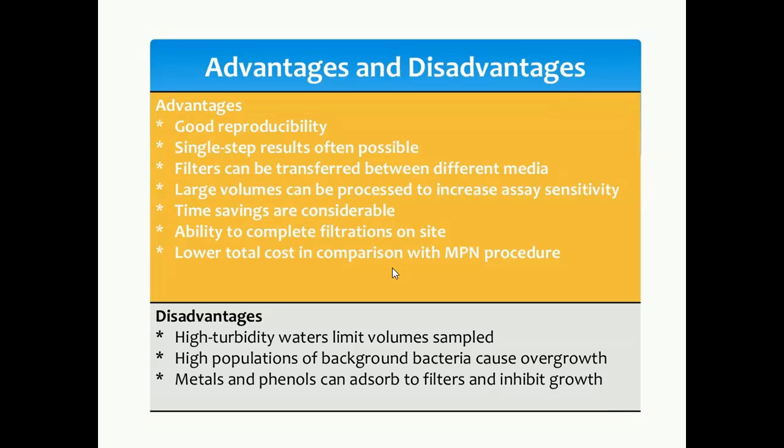Advantages and disadvantages of the membrane filter technique. Here we are observing the advantages: good reproducibility, single step results often possible, filters can be transferred between different media, large volumes can be processed to increase assay sensitivity, time saving is considerable, ability to complete filtration on site, lower total cost in comparison with the MPN procedure.